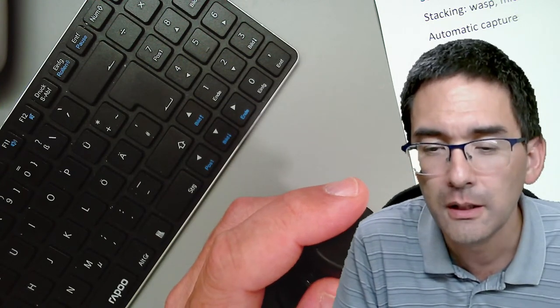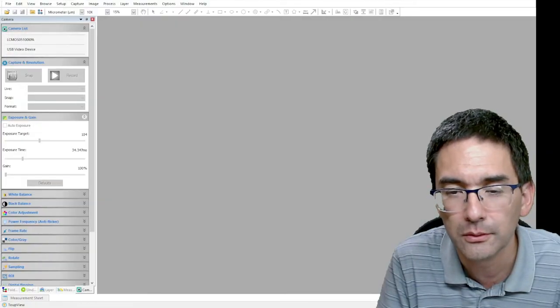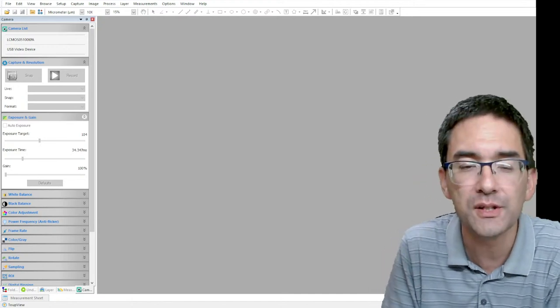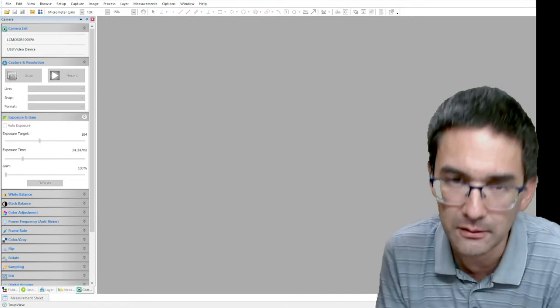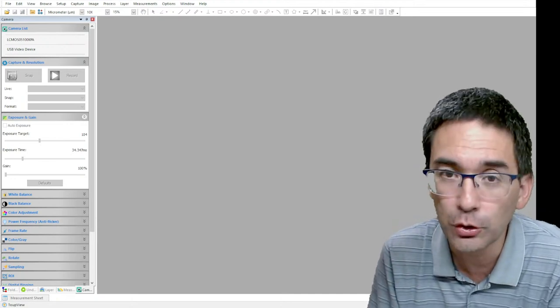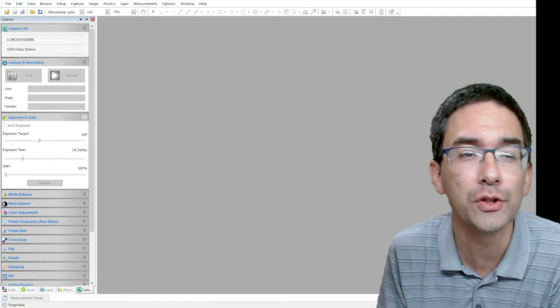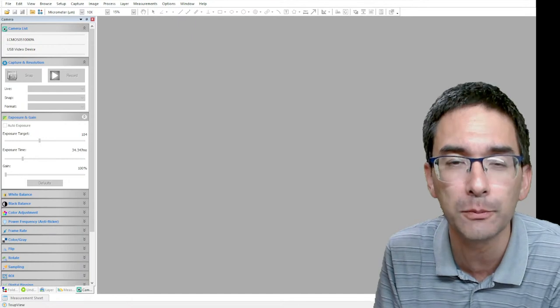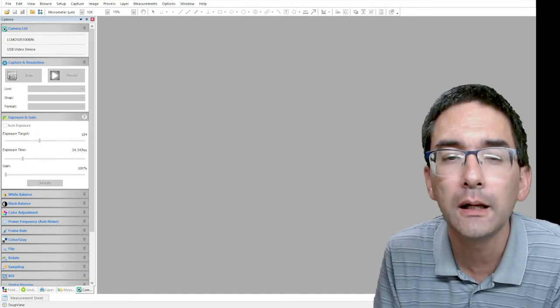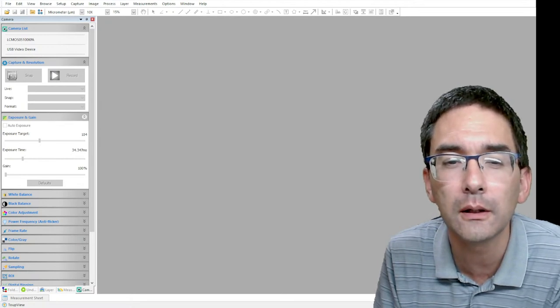So here we are again. So I have to go to Windows. Here we go. Okay. So what I would like to show you now is another interesting feature, and that is the stacking. Helicon Focus has already been mentioned before, which is a commercial program which I've used. I like it a lot. But if you just want to try it out and not pay anything, then you can try it with this program over here.